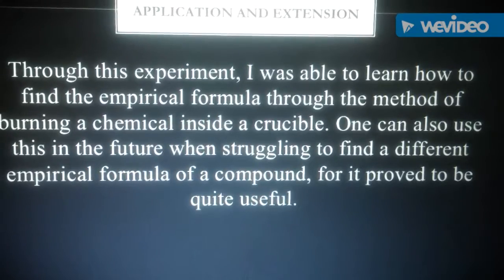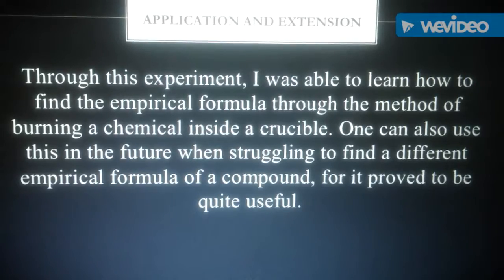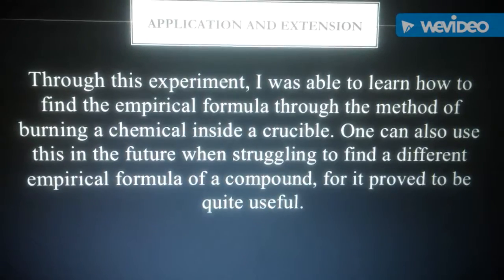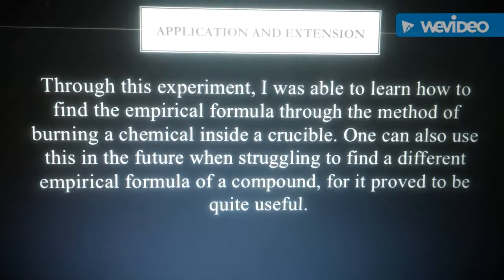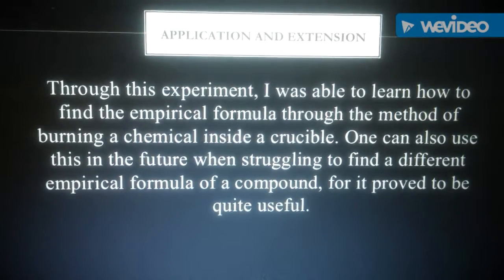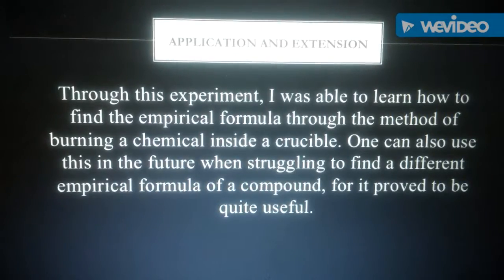I would like to conclude with saying that through this experiment, I was able to learn how to find the empirical formula by using the method of burning a chemical inside of a crucible. One can also use this in the future when struggling to find a different empirical formula of a compound, for it proved to be quite useful.